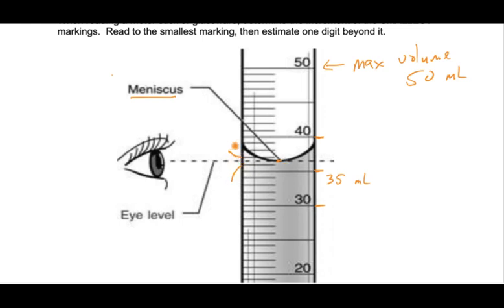Let's mark off the two lines — this would be 36, and this top one is 37 milliliters. It looks like the meniscus is either right in the middle or just a little bit above the middle between the two marks. That means we can actually estimate the next digit — that would be the tenths position, the estimated digit.